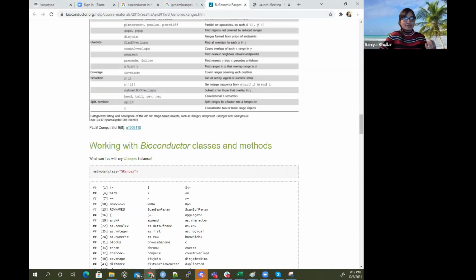But I just hope you can understand the basics of how you overlap two regions, especially like a snippet or one base pair position inside another, or see if one is found within the other, for instance. If you have maybe a short sequence, see if it's found within larger sequences, for instance. I think in those situations, the query and the subject could matter depending on which one is longer and which one you're trying to see falls within the other. But GenomicRanges is going to try its best to map them to each other.